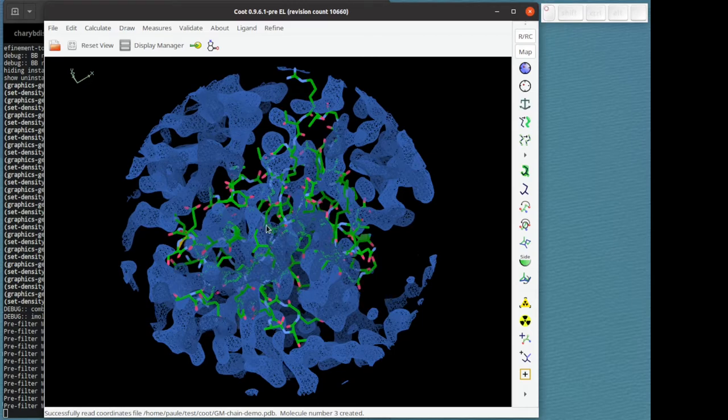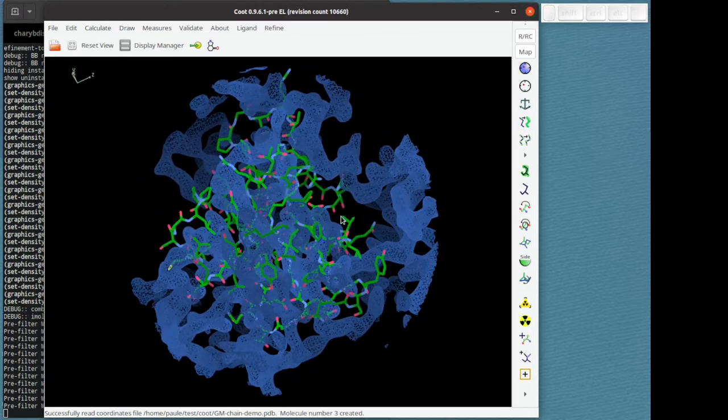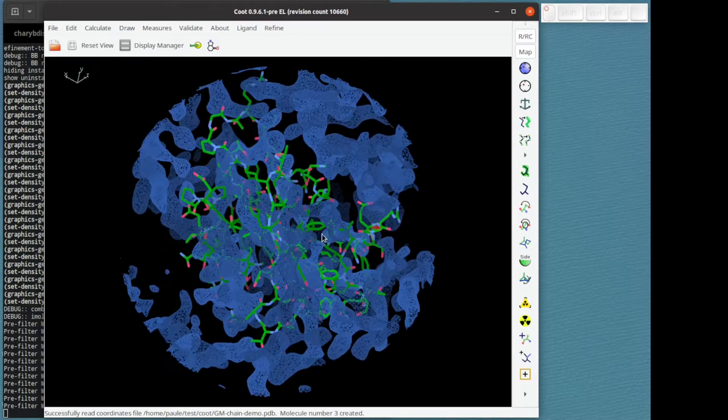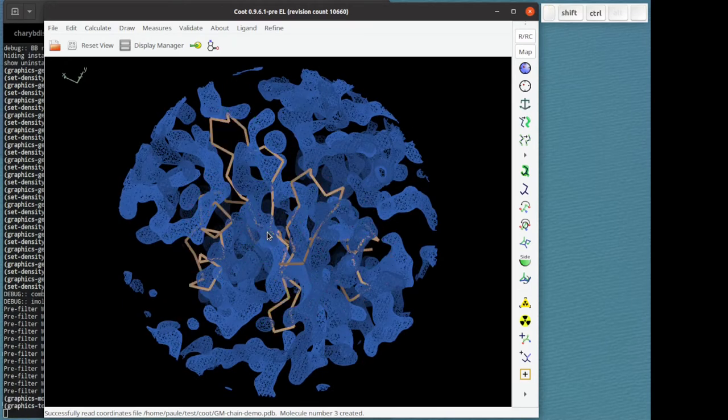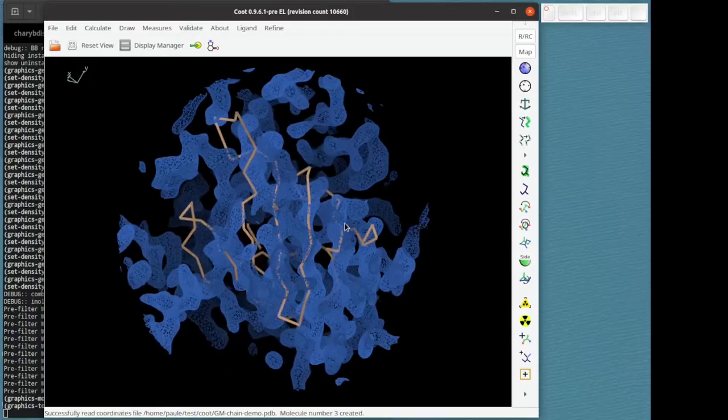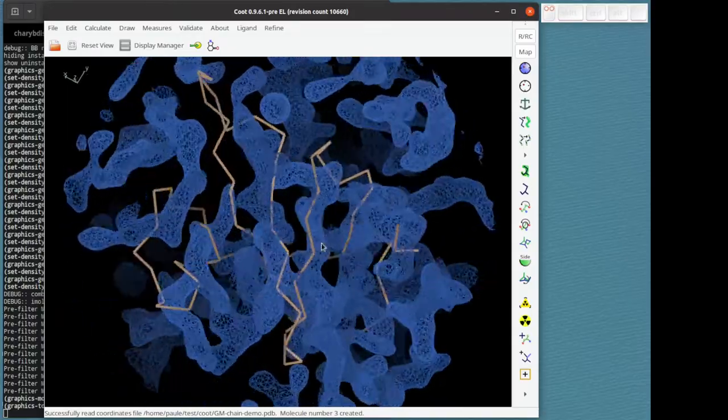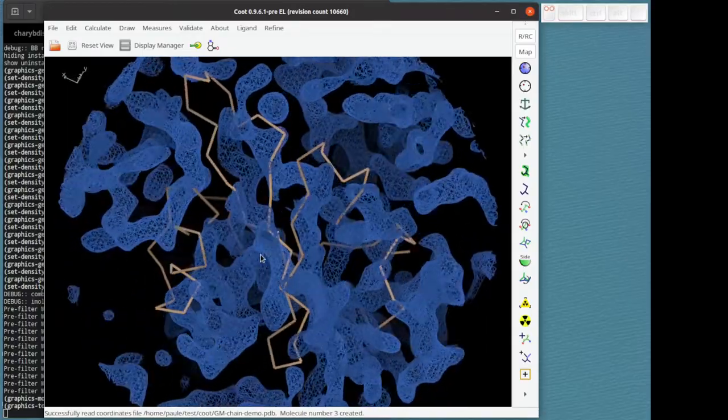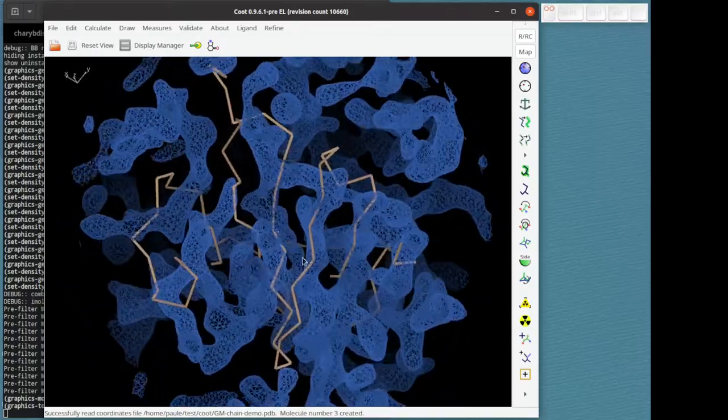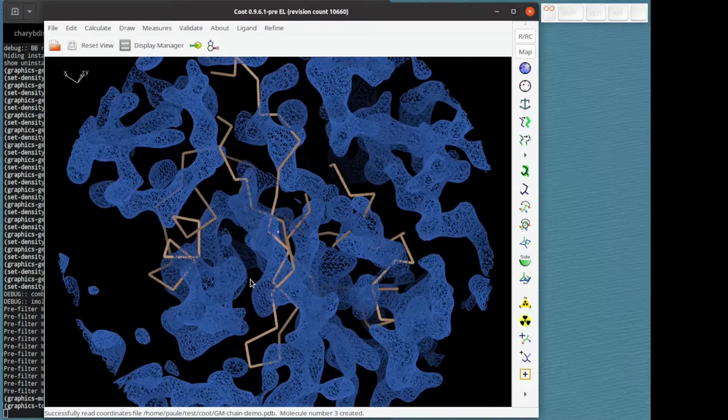So now we have a model and a map that are not well correlated. If I scroll forward, control shift forward scroll, I can change the representation and you can see it's C alphas and it doesn't fit well. There's quite a difference between the model and the map.